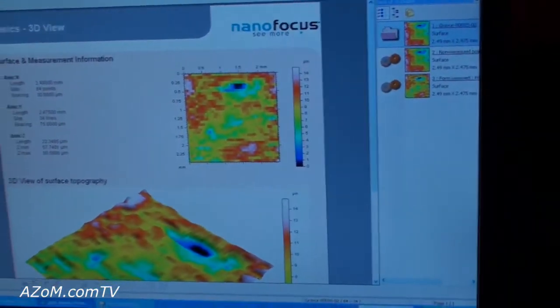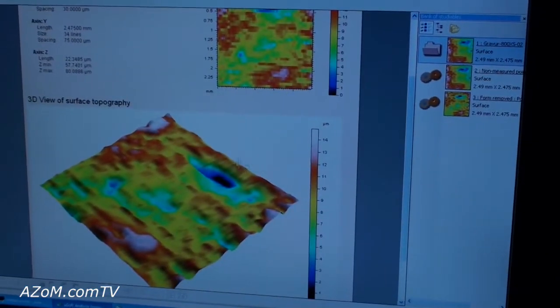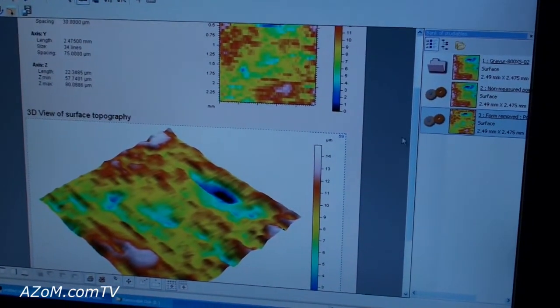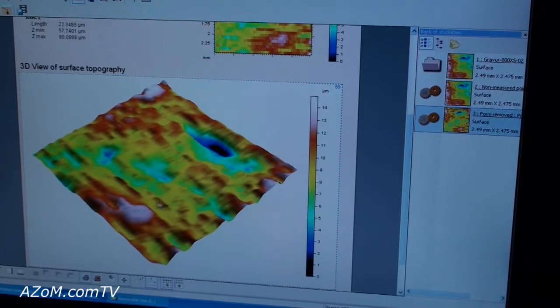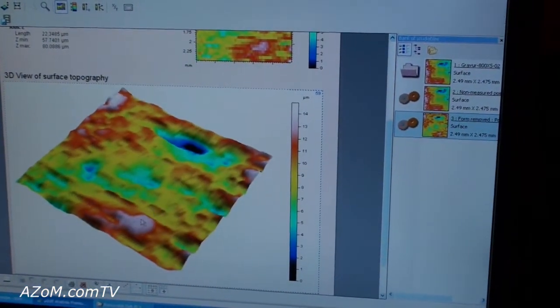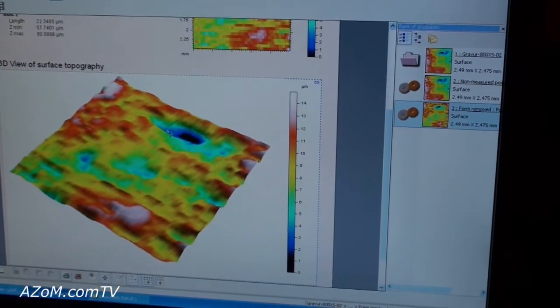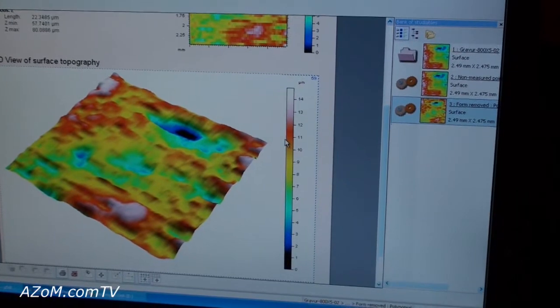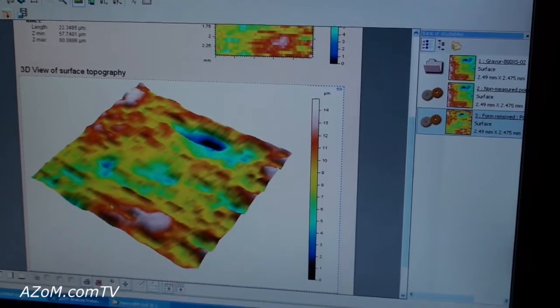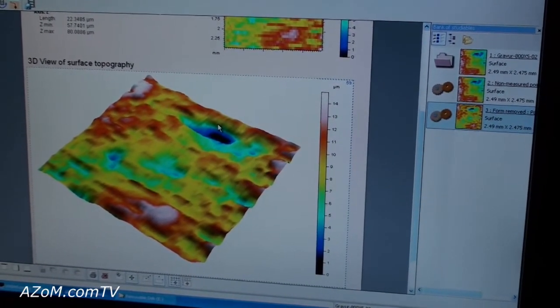Now that the measurement has been completed, we're looking at a 3D view of the paper we just scanned. It's a low-resolution measurement just as an example, but we have a full 3D view. The high spots are shown in white, and the blue areas are pockets on the surface, giving us a real surface topography.